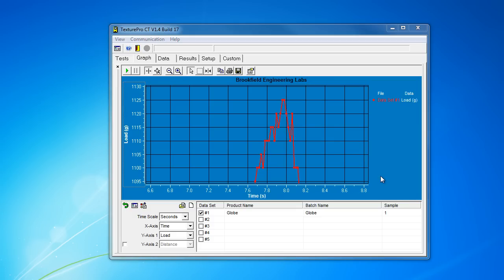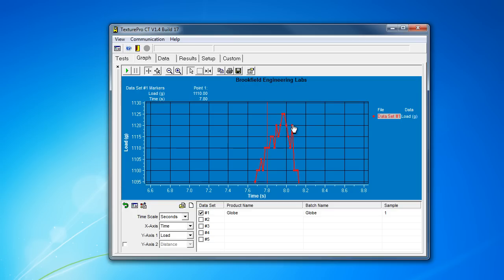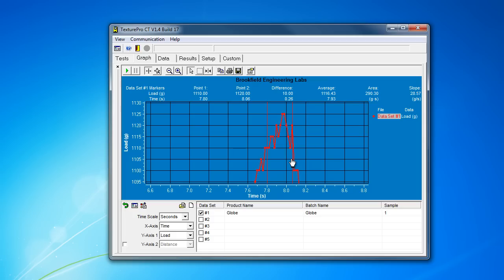There's really no way to view the data very well on your screen. What I'm going to do here is drop two anchor points on the graph. This will tell me some information about the comparison between these two points on the screen, but it really relies on the operator's ability to actually click the individual data points on each replicate you do.